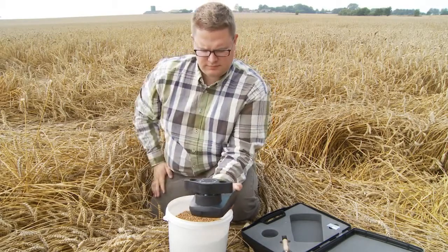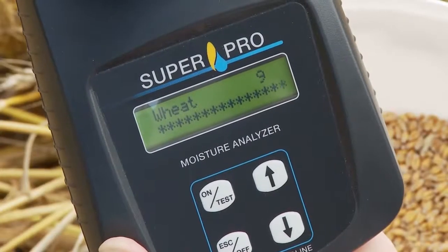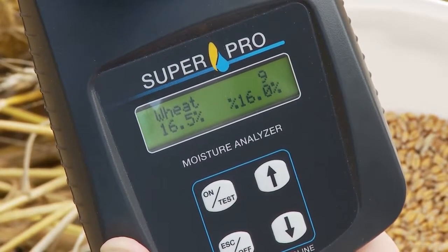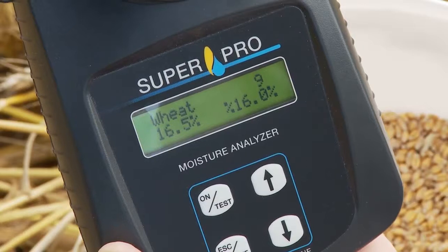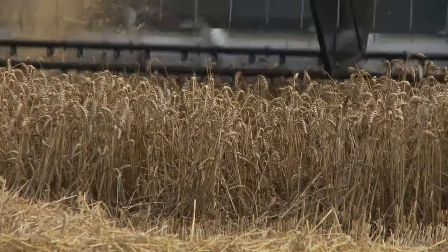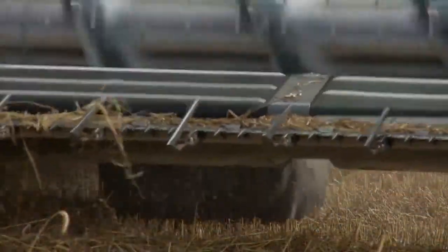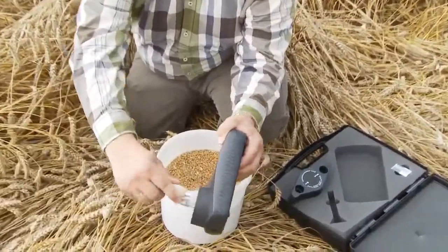Press the test button and you can read the moisture content directly from the display. At the same time you get an average value for the last four measurements done. Use, for example, the SuperPro in different parts of the field to determine when to begin harvesting.